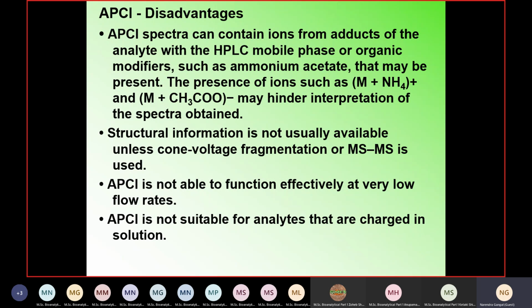See, you can't tell the solvent, "Baba, you have to form a positive charge, then transfer that positive charge to my compound of interest and get out." It doesn't happen like that. Solvent will play its role anyway. So the solvent and the buffers will always have the adducts. They will form some association type of complexes with my compound of interest also. Then my molecular weight goes up substantially, and those peaks may give me some confusion in my interpretation of the spectra.